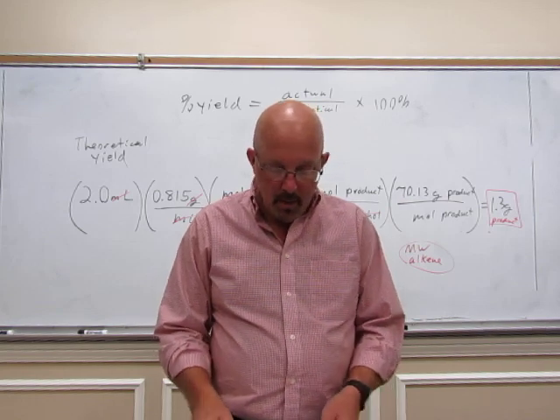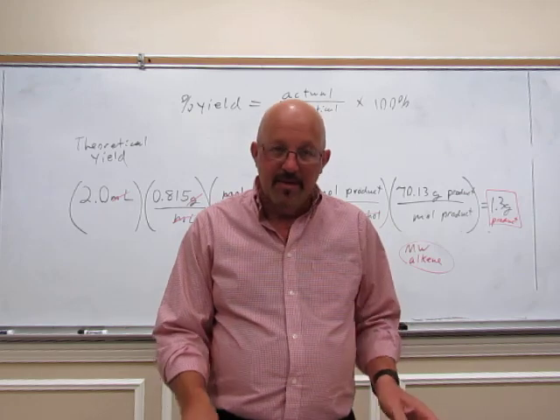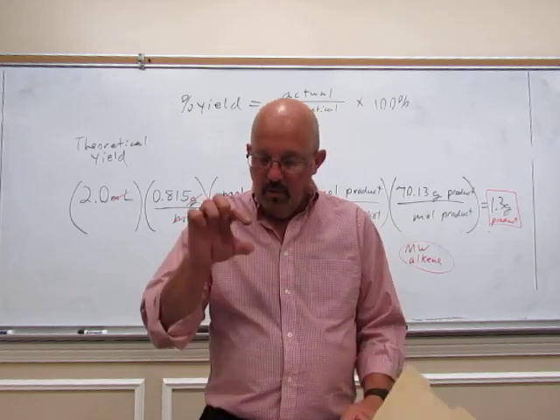Remember the carbon-carbon double bond stretch. That's down about 1620 to about 1680 reciprocal centimeters. Usually pretty small.